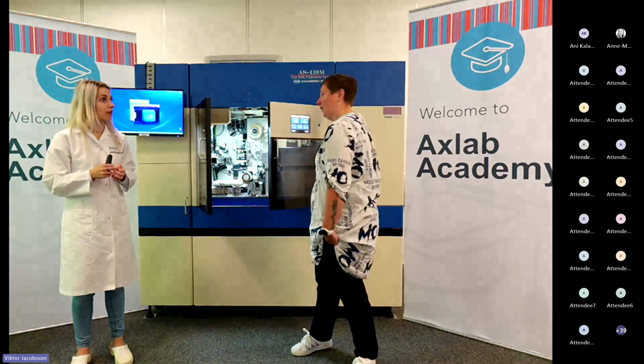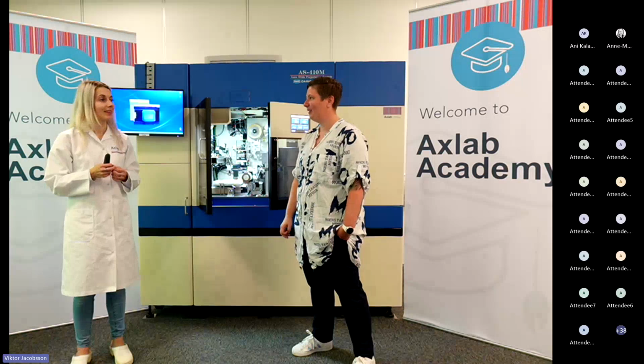We are looking into a future where we want to automate solutions pre and post sectioning. So we might see where this goes, but currently we do not have any solution for that handling of the slides. Yeah, and it's an interesting topic because there is so much talk about robotics, and I know this is robotic, but maybe there is something in between to load from one tray to another tray or rack or whatever you are using. We will see what the future brings us.